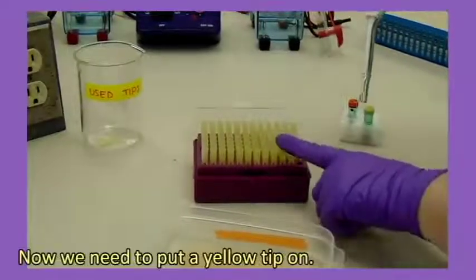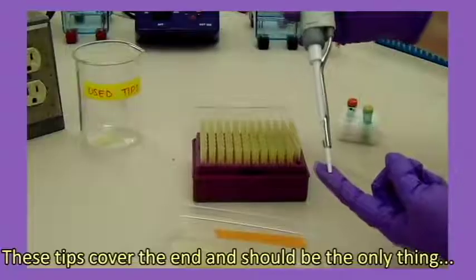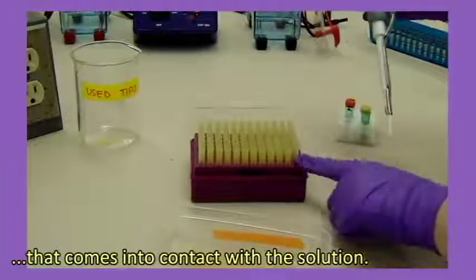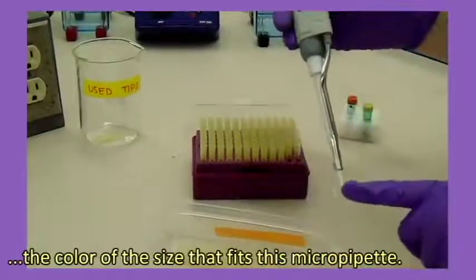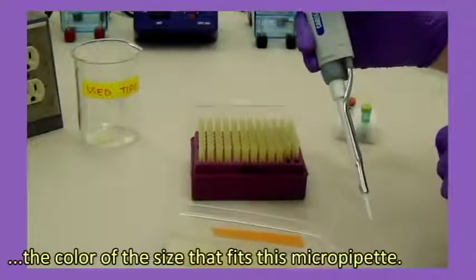Now we need to put a yellow tip on. These tips cover the end and should be the only thing that comes in contact with the solution. The tips are color-coded and yellow is the color of the size that fits this micropipette.